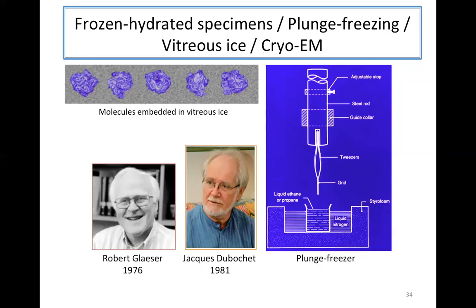So he had essentially already the idea, but the difference was that he used liquid nitrogen all by itself. And that poses a problem.